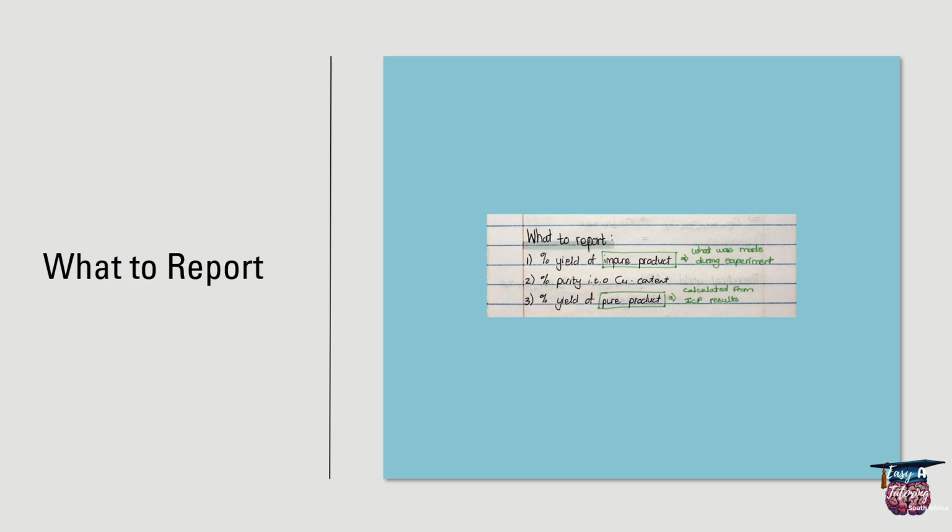And if you aren't sure of these calculations, you can always ask a friend, a lab manager, someone who knows these techniques better than you. If it's not given to you in your experimental guide, you can also just leave a space, and then once you get this information, you can write it down there.